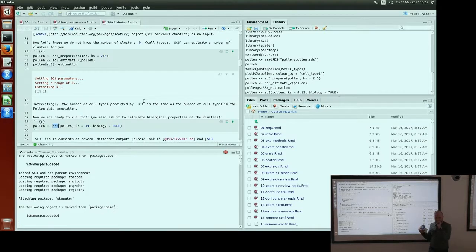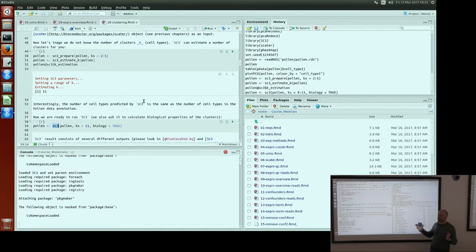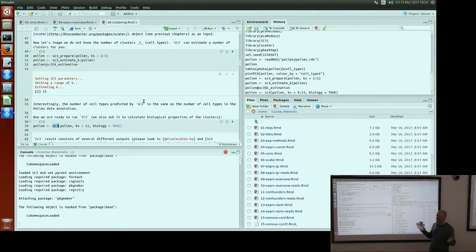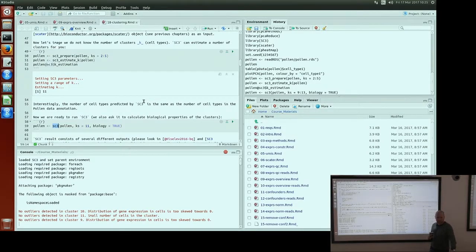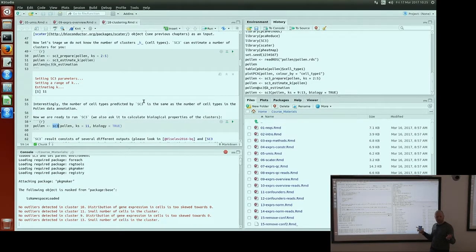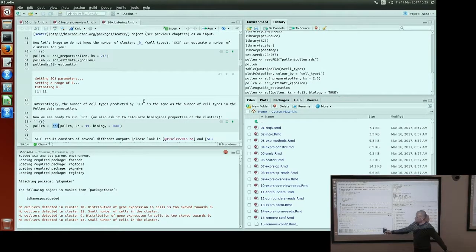The question is: can we rely on this estimated k parameter? I would say, in the beginning, if you don't know anything about your dataset, it's good to run this and then explore different k values around this value. It's usually close to the truth, but sometimes it's wrong. SC3 is still running because we asked for k from 9 to 13 — it runs clustering five times and also calculates the biological results, which takes quite a lot of time.